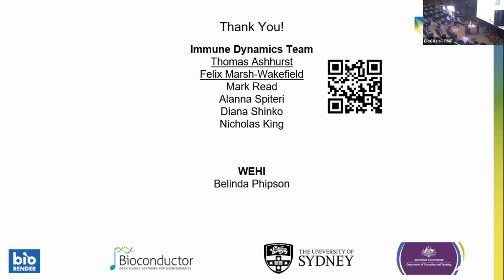And he found it a bit difficult to interoperate between different packages as well, because they seem to like different objects. So then he came up with this concept of Spectre. We need to build something that is easy for someone who is not very experienced with programming, like he was when he was doing his PhD, to actually analyze the data using R rather than just using FlowJo software. So this is the big motivation for Spectre.